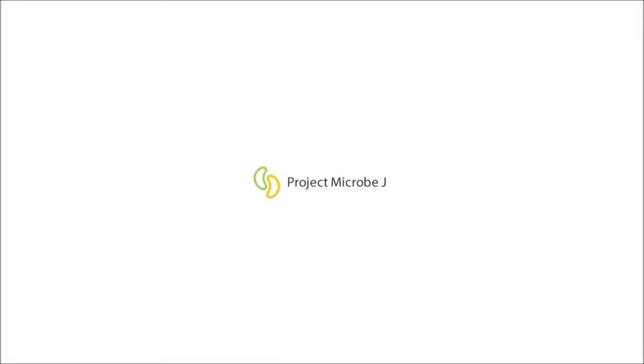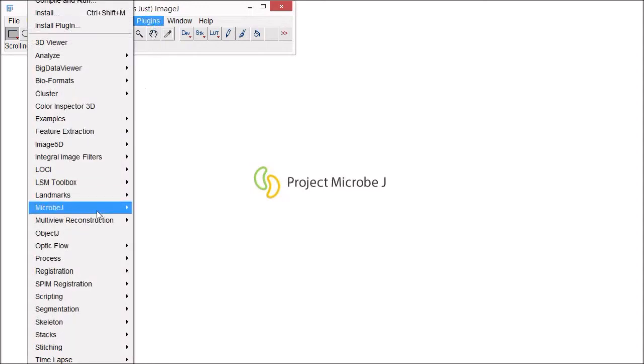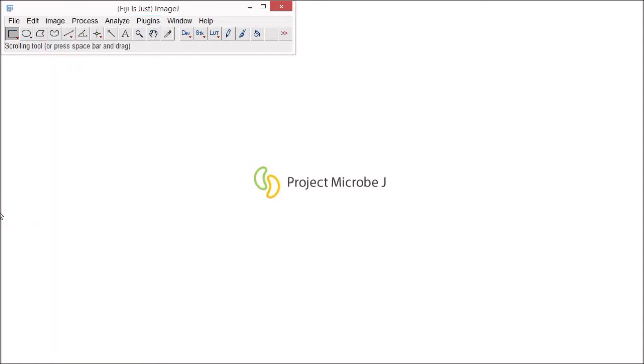In this video, I'm going to show you how to rapidly get started using MicrobJ. You'll find the MicrobJ plugin is located in the Image Plugins menu.